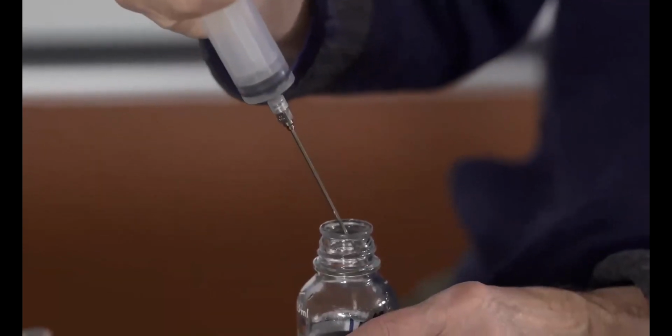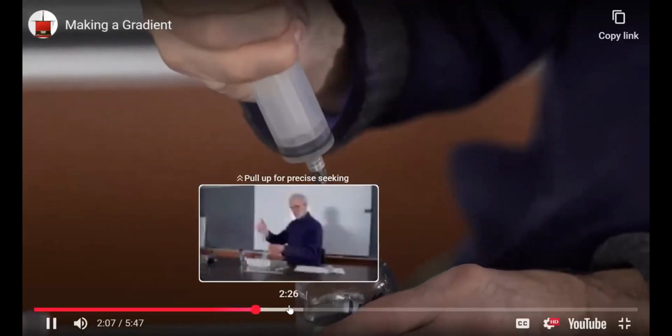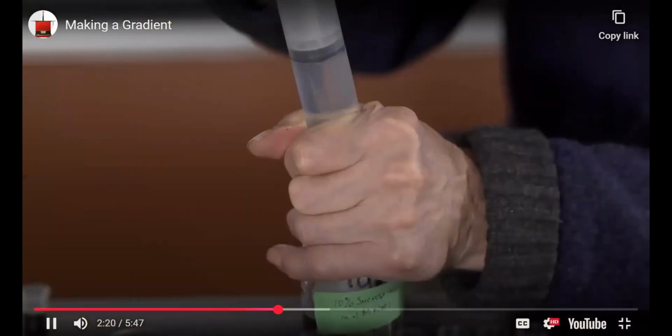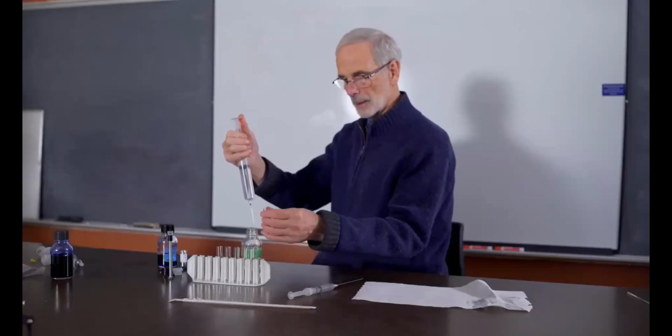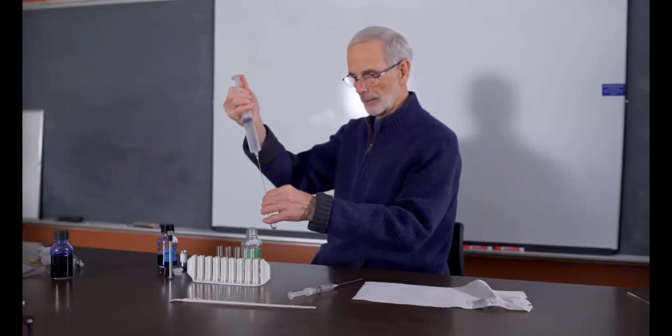So no air bubble is present. We are releasing the content in the syringe. 10%, because you are layering in the tube, right?